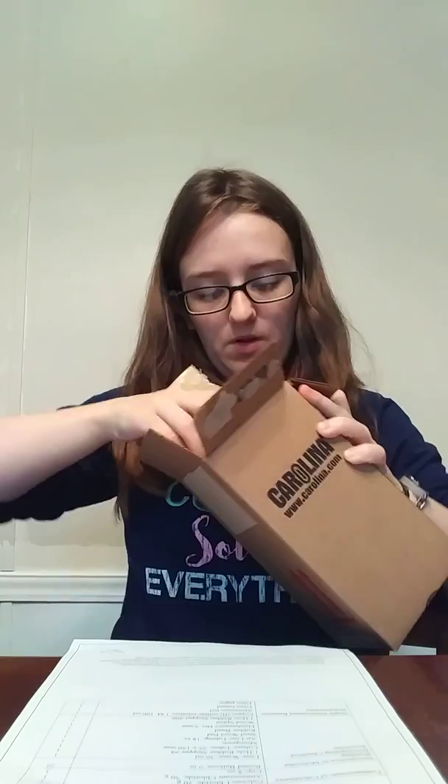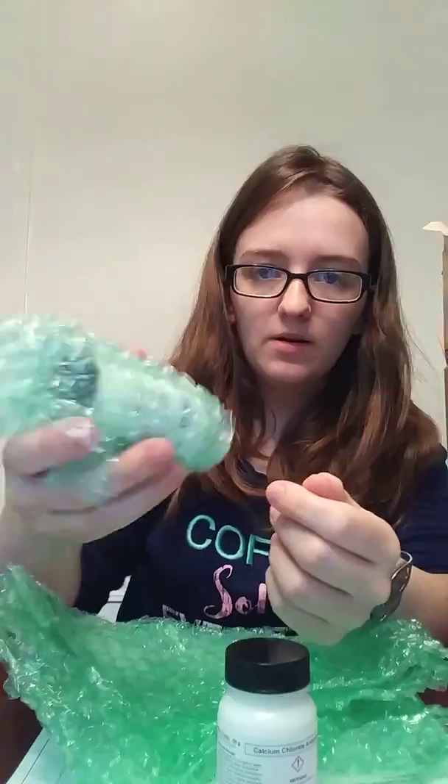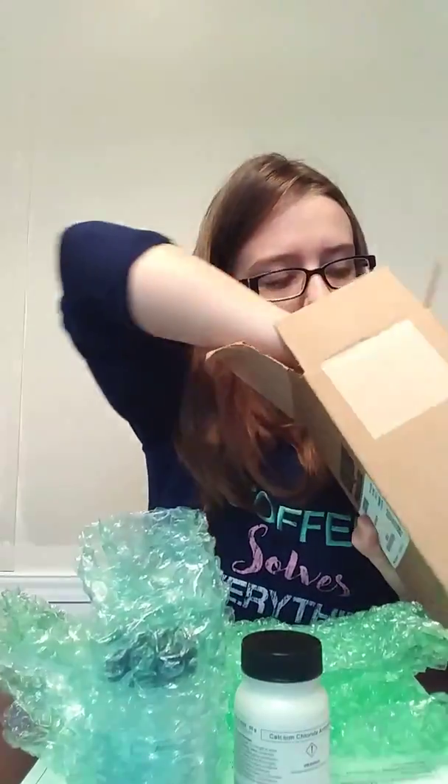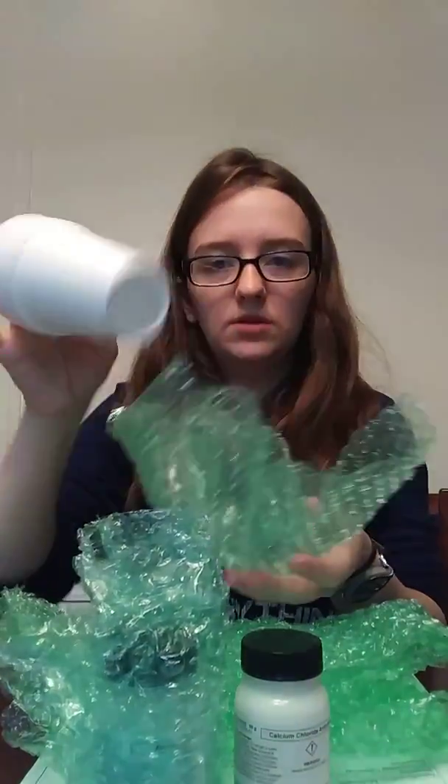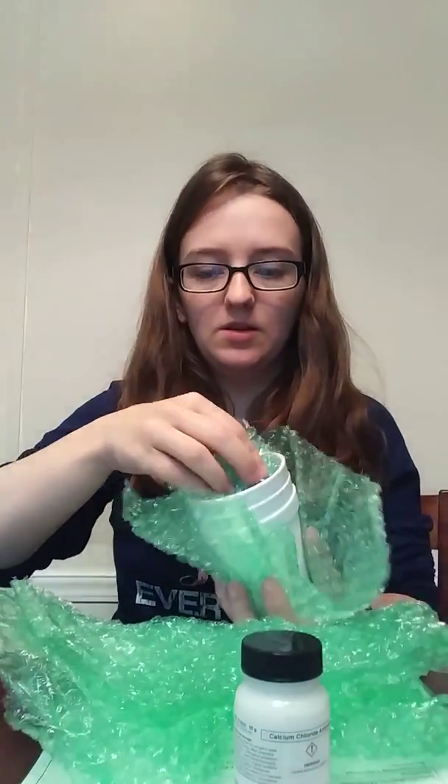The next one is this box, which I already had to cut open with a knife — it had really thick tape. It has calcium chloride, which is like a powder, and ammonium chloride, which is also a powder, and then three styrofoam cups. They really packed this one — they didn't want it shaking all over the place.